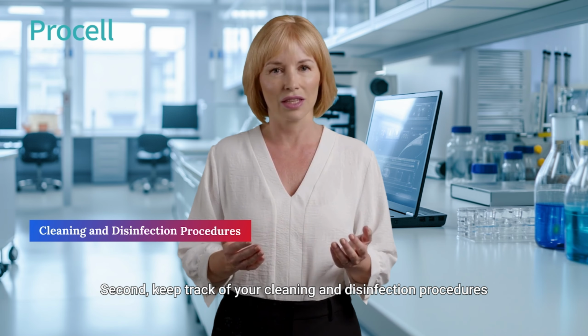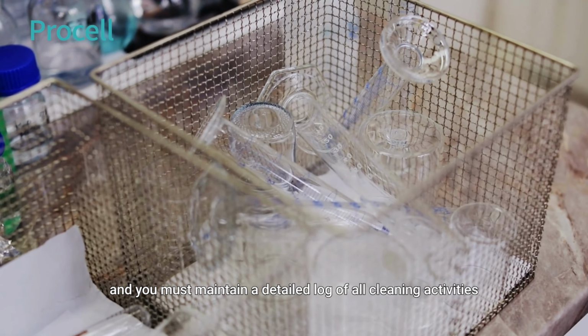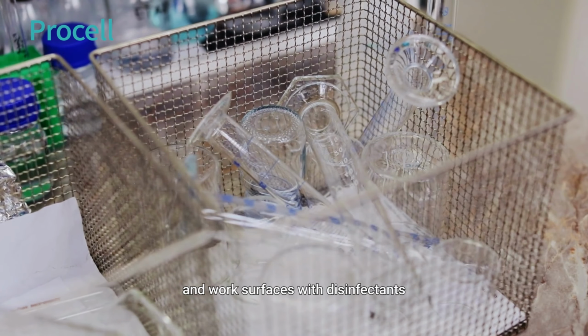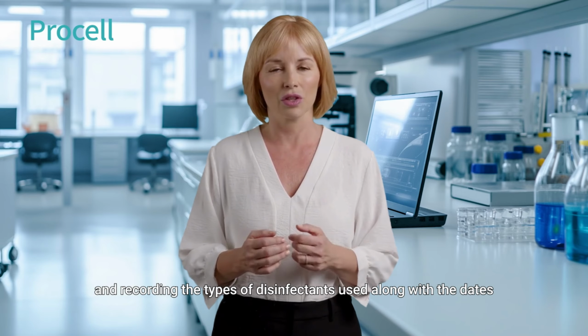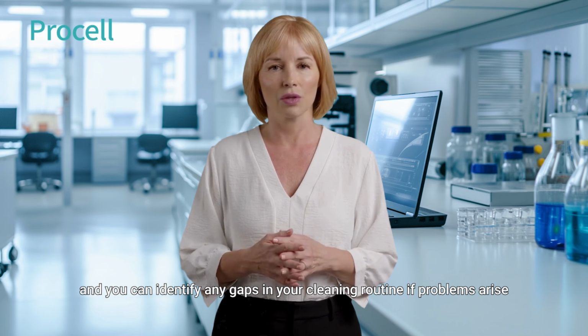Second, keep track of your cleaning and disinfection procedures. Cleanliness is absolutely critical in cell culture, and you must maintain a detailed log of all cleaning activities. This includes wiping down biosafety cabinets, incubators, and work surfaces with disinfectants, and recording the types of disinfectants used along with the dates. By maintaining this record, you ensure that your workspace remains sterile, and you can identify any gaps in your cleaning routine if problems arise.